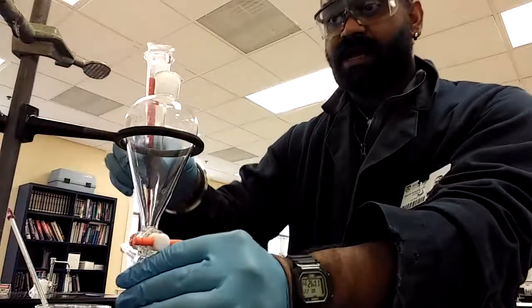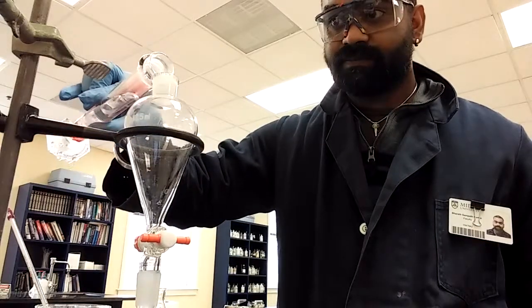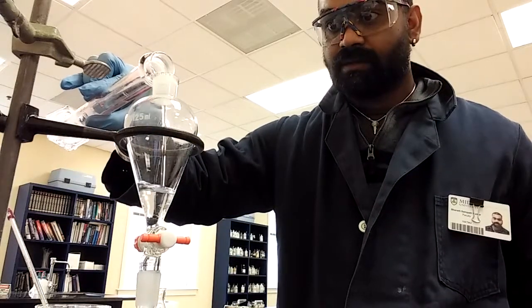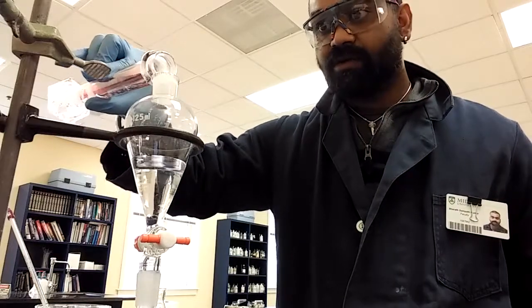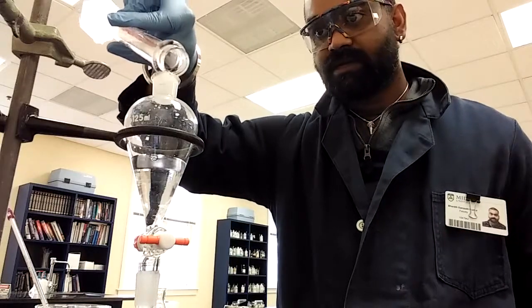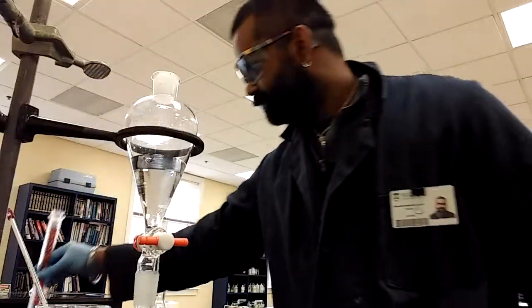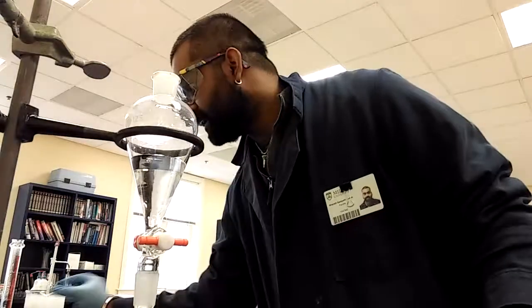So I'm going to add all of this in one go, the hydrochloric acid. That's 35 milliliters of 5 degree cold hydrochloric acid. Get every last drop. Alright, so that's the hydrochloric acid.